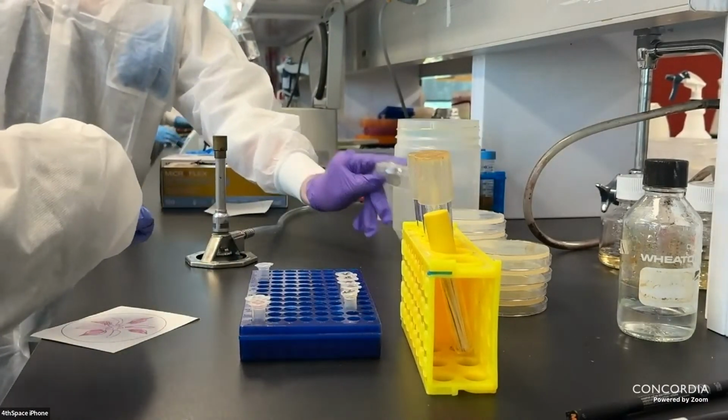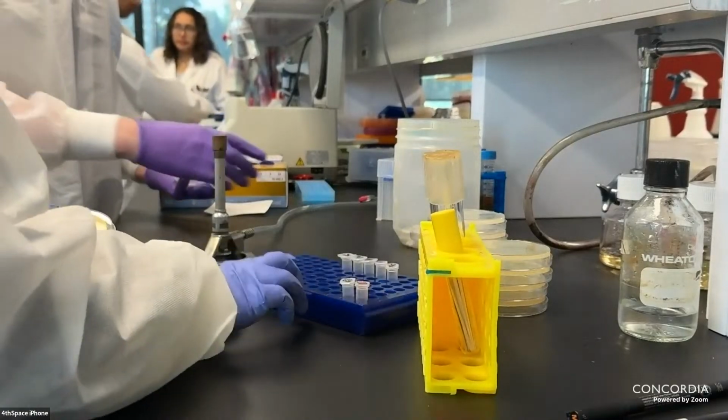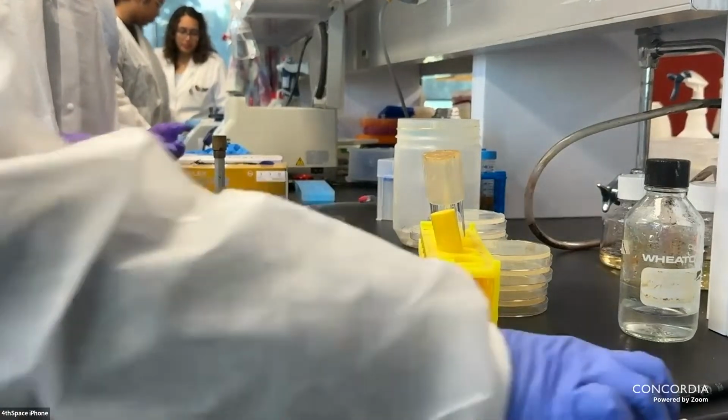No, that's perfect. Also, if you accidentally double dip or you think you contaminated a culture, please let us know so we can give you a new one.